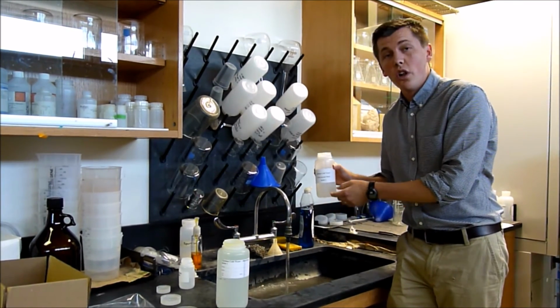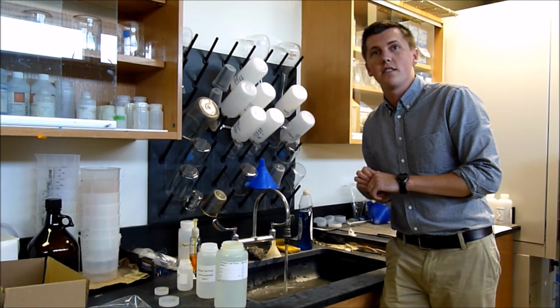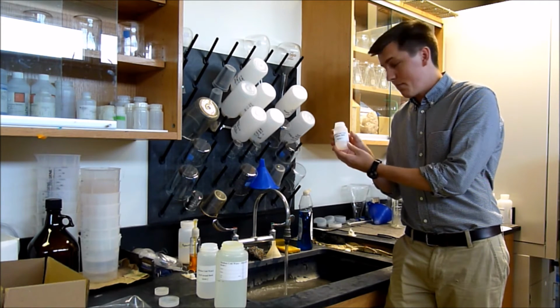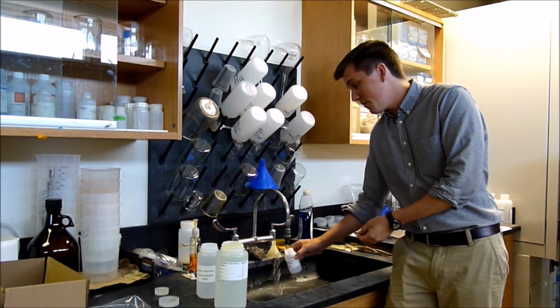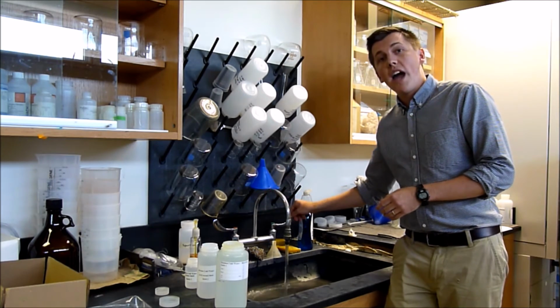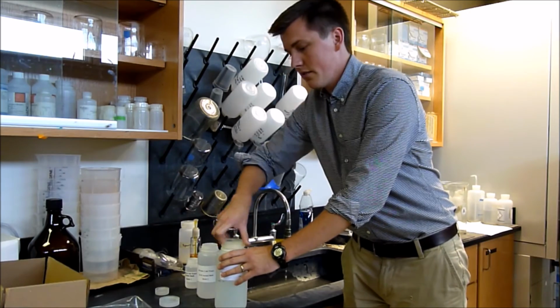When this bottle is full, I'll remove it and set it aside and start my timer for another 2 minutes. Now that the water's been running for a full 2 minutes, I'll collect the last and smallest sample by sticking the bottle underneath the faucet again and letting the bottle fill up, and then I'll set that aside. Now that we've collected all 3 bottles, we can go ahead and turn the tap off and place the caps onto all 3 of our bottles.